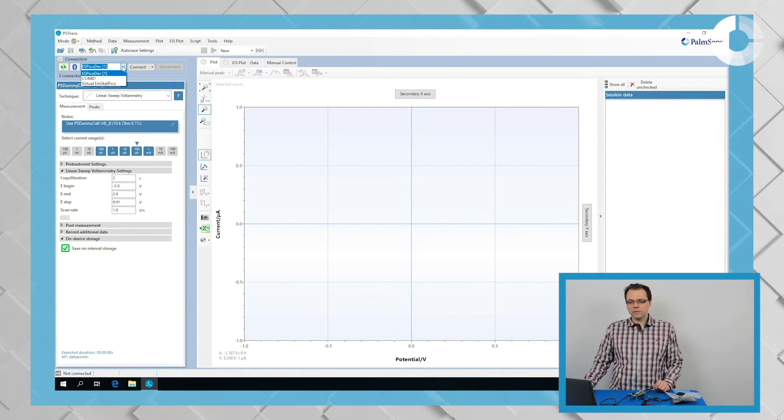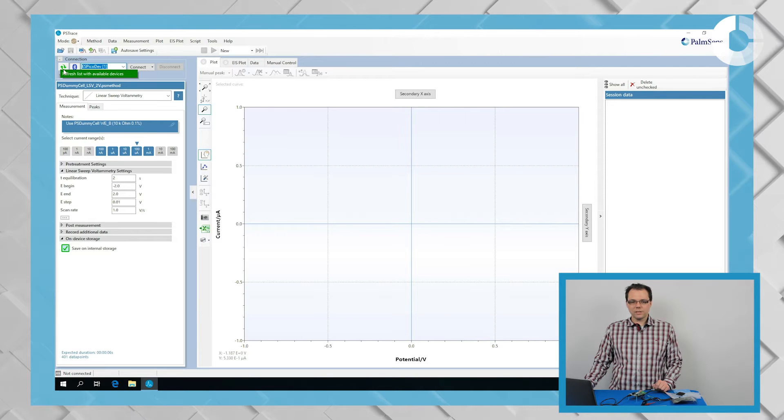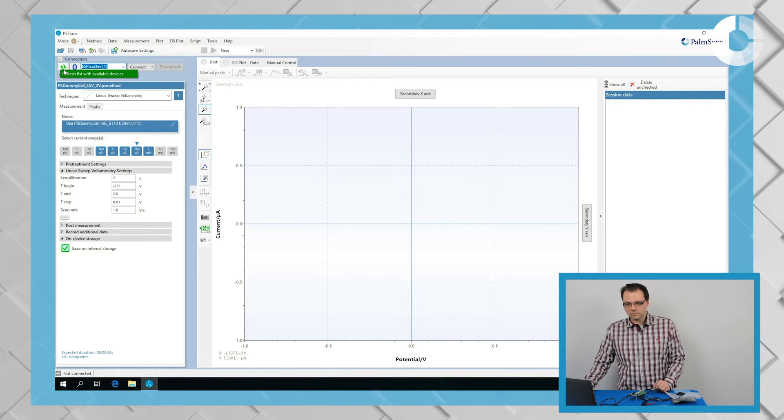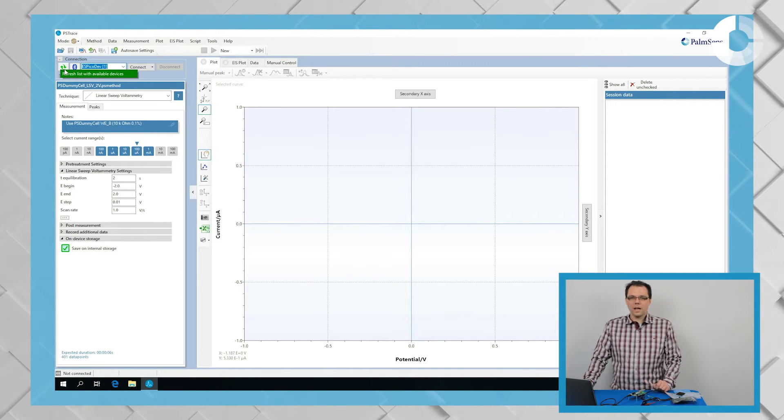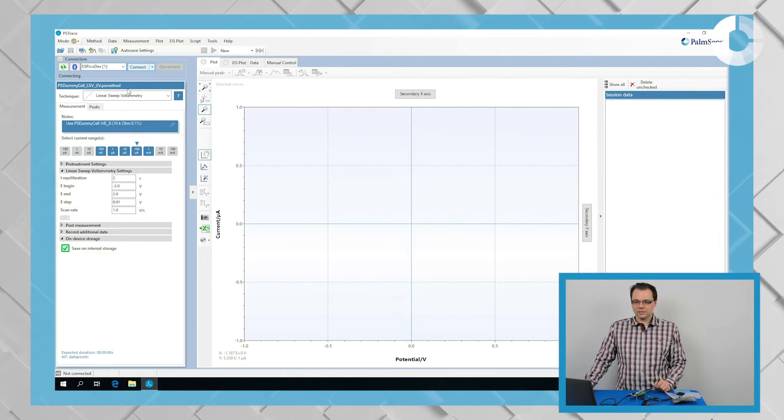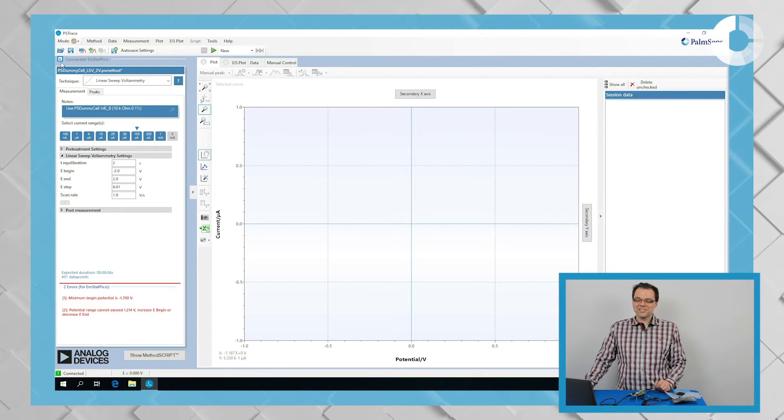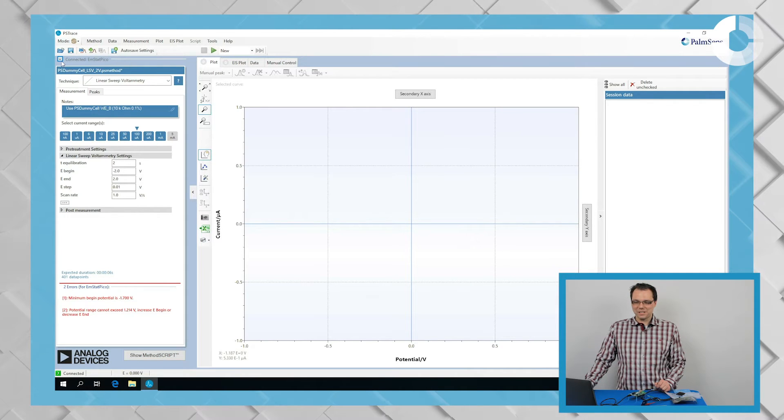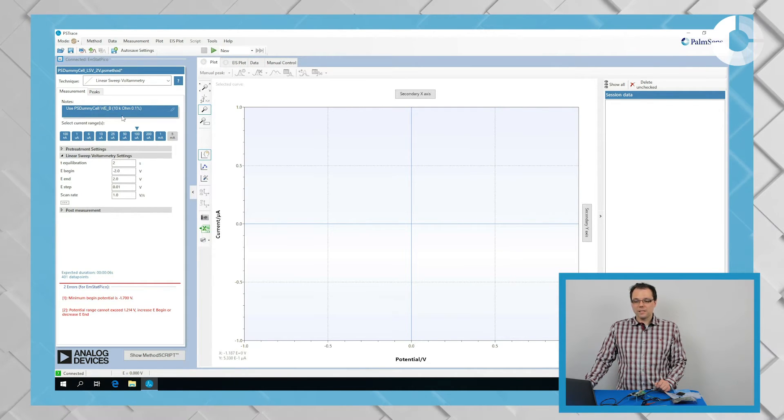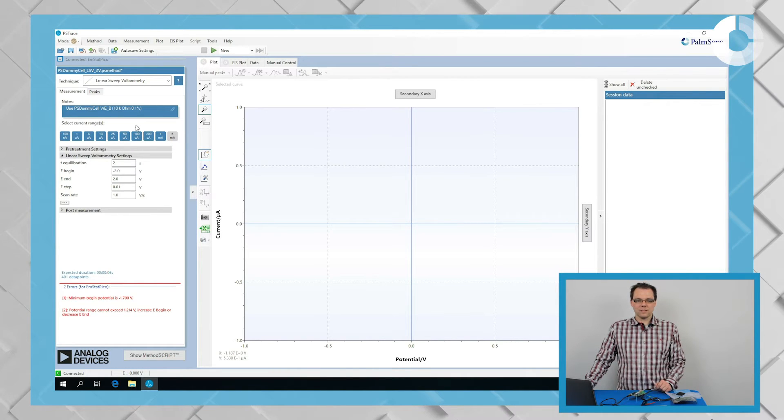If it's not in the list at all, you should click the refresh button. And then it should appear in the list. When you press the connect button, you get the message that you're connected to the Amstead Pico and you can start entering your parameters.